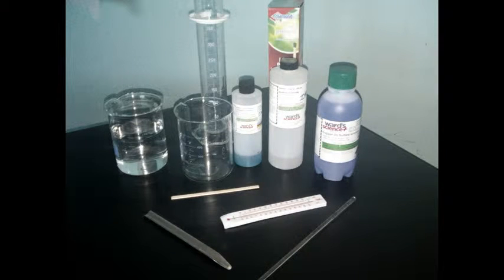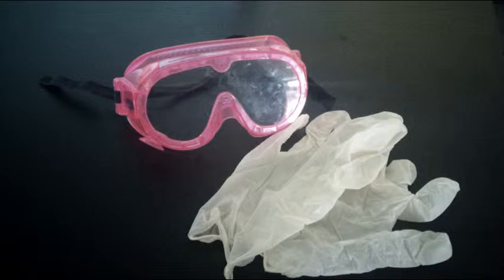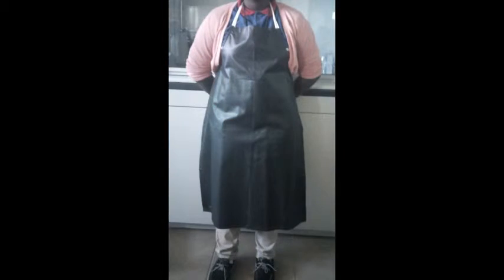my PBL project is how aluminum will undergo a single displacement reaction. My project materials were a beaker filled with distilled water, a graduated cylinder, a stirring rod, a thermometer, and of course, aluminum foil. My safety materials included goggles, gloves, and an apron.